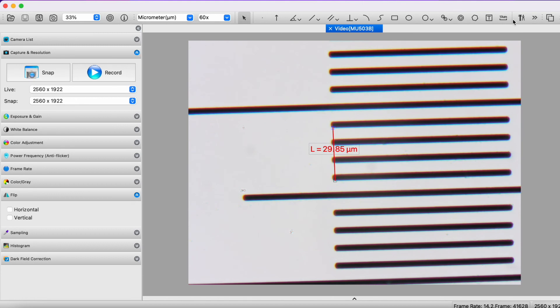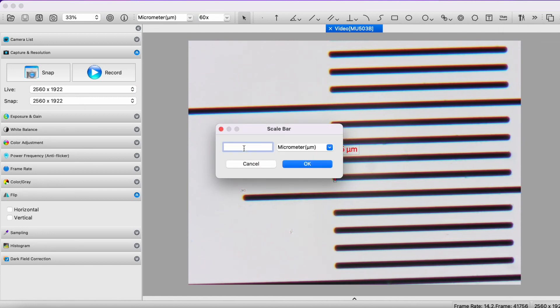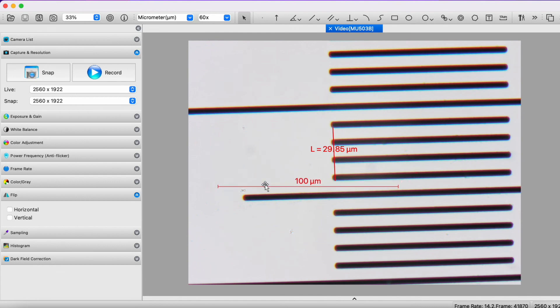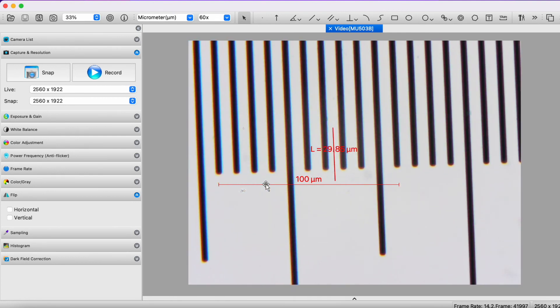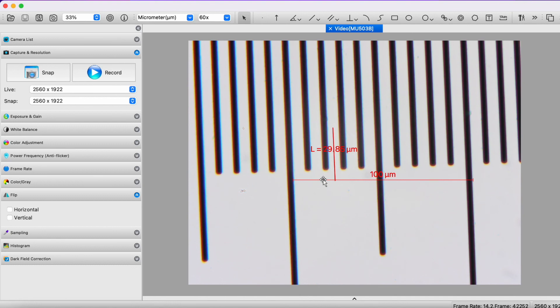You might be interested in putting a scale bar into your pictures. We can go to this scale bar icon and draw a scale bar of 100 microns long. Click OK and there is the line. I'm just going to rotate my camera about 90 degrees to see if indeed this line is 100 microns long — it is certainly very close, with a little error. There is always error because we are humanly placing the lines during calibration. It would be nicer if the calibration involved multiple steps such as drawing the lines three times, but this software only has a one-step calibration.